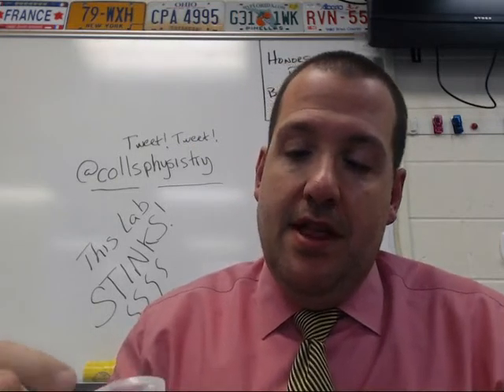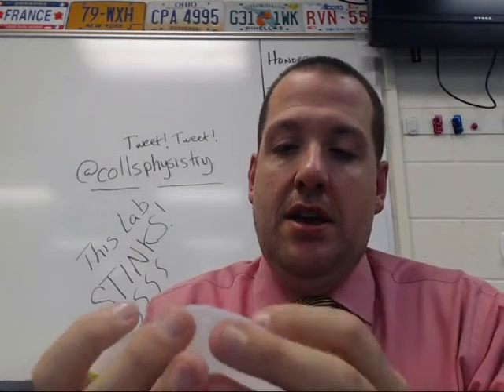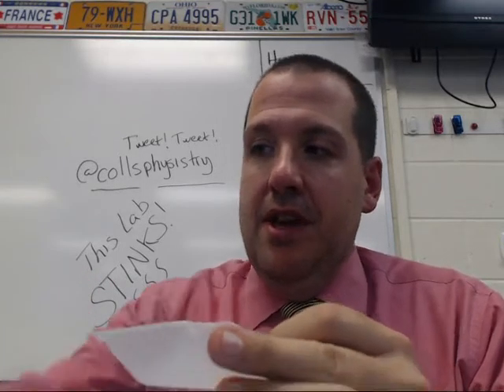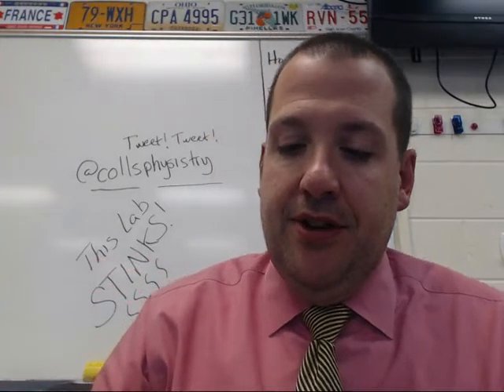Now, then you're going to mix the two together. You're going to combine the two into one, and then you're going to observe its properties again, okay? Probably the important thing is to know that you want a magnet, okay? And then you're going to make observations.